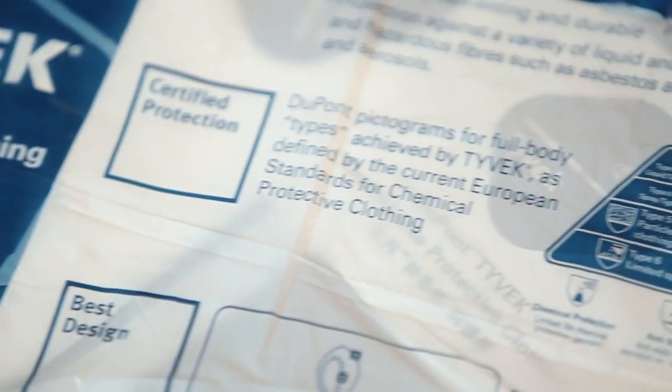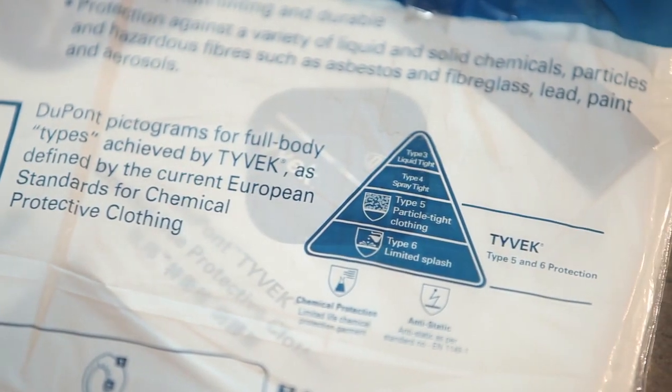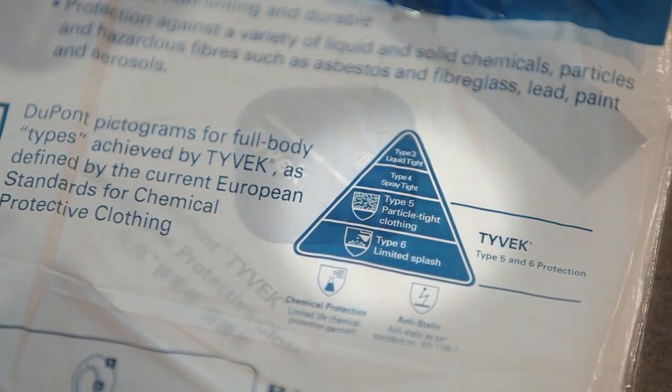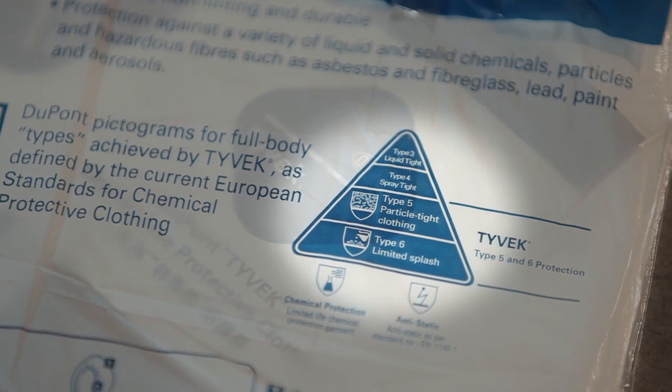The rating of the PPE you need to wear to complete the task is critical. Certain items of PPE such as respirators and coveralls are rated depending on the hazards they protect you from. If you need to wear PPE, you must be trained and given instructions to know how to use it and dispose of it properly.